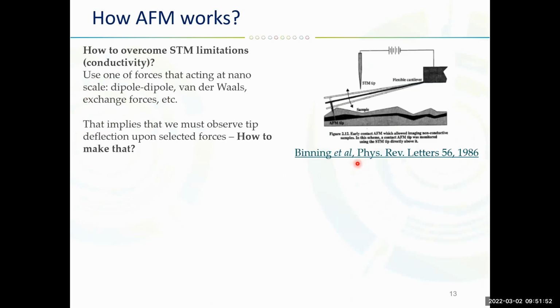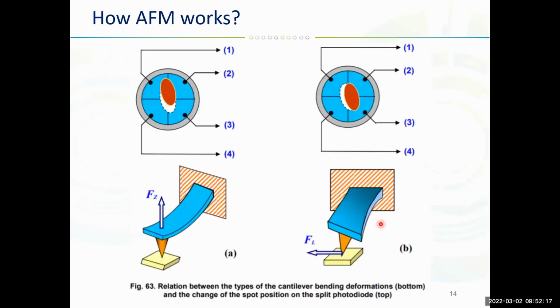And one of the main forces that is used here is dipole-dipole force, van der Waals force, exchange forces, all these forces that we were talking about last time. So we use a needle or tip to measure the displacement of the cantilever.